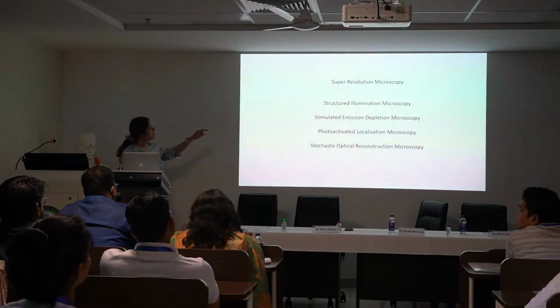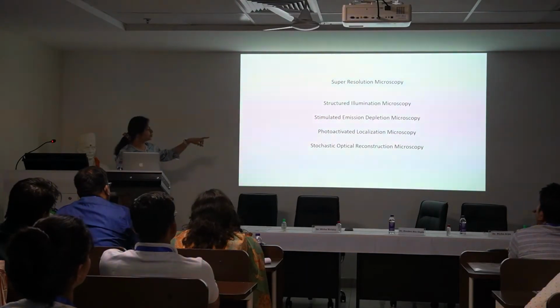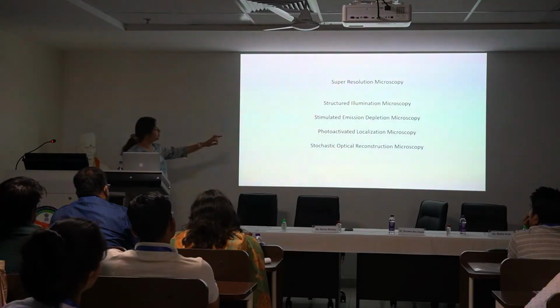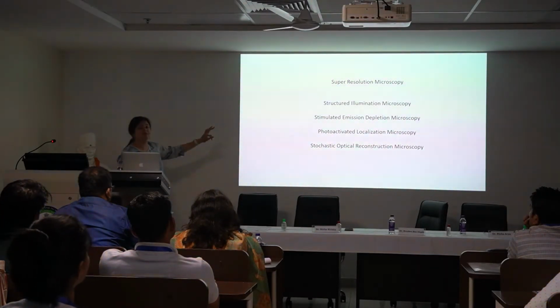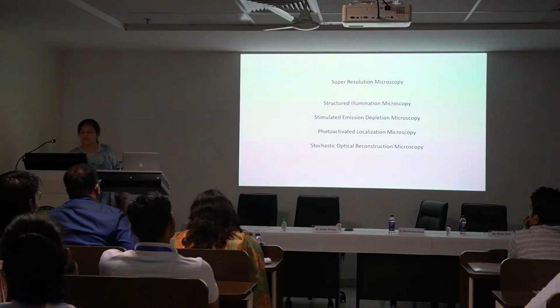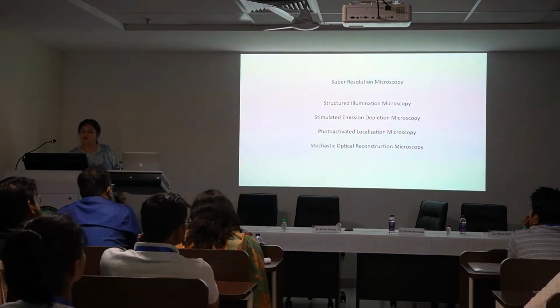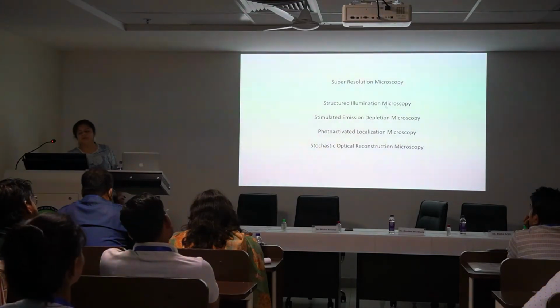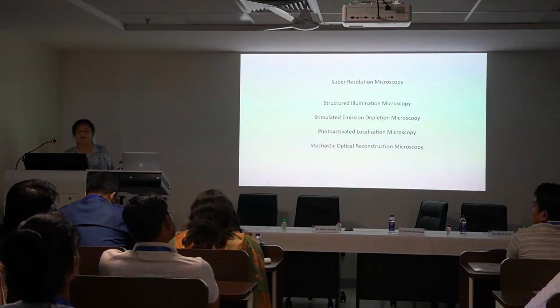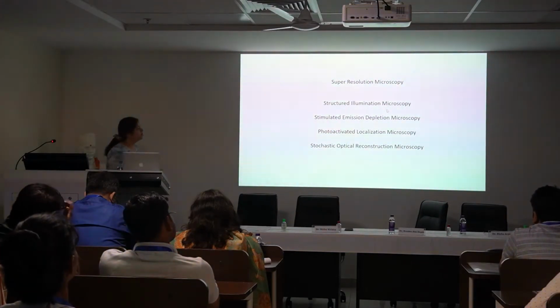I will show you something more about photoactivated localization microscopy, and only compare photoactivated localization microscopy with stochastic optical reconstruction microscopy. These two are very similar to each other. This one and this one in some sense are similar to each other, but we'll see how they are achieving super resolution.